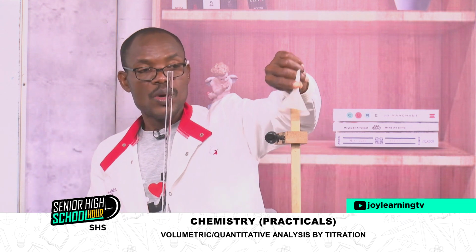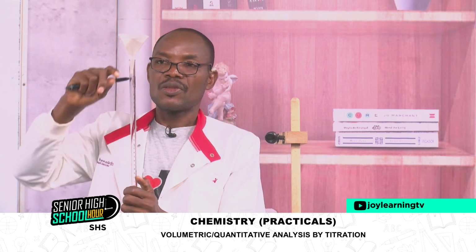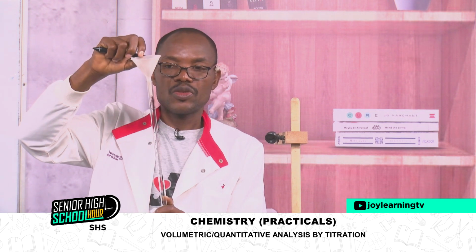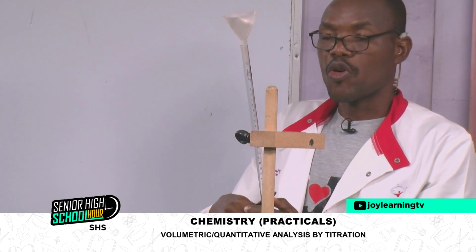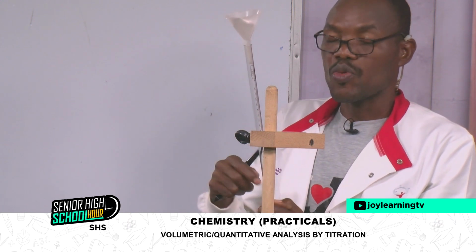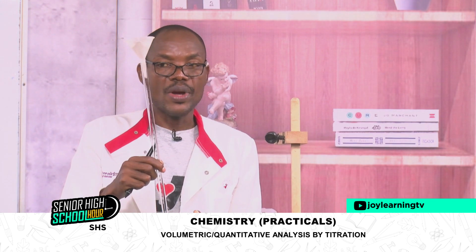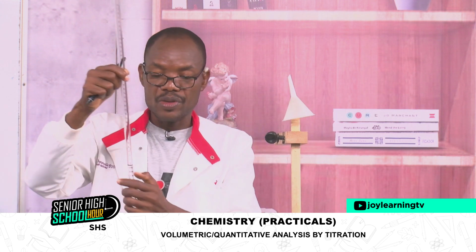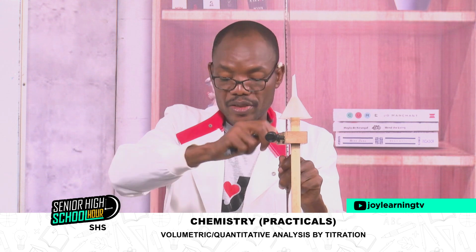If you don't do it like that, and you take your reading, those solutions that have clinged to the funnel may drop in the course of work, and that will affect the volume. So always remove the funnel before you take your reading and then run your titration.